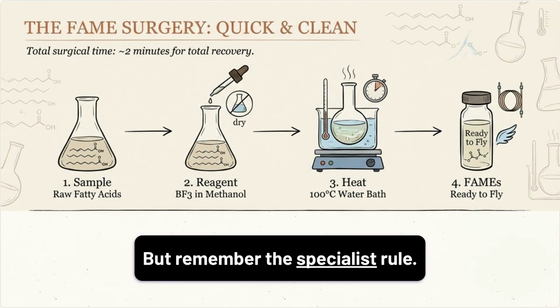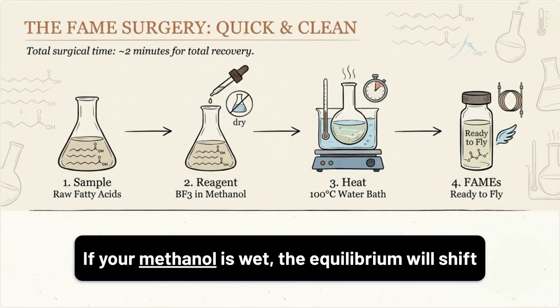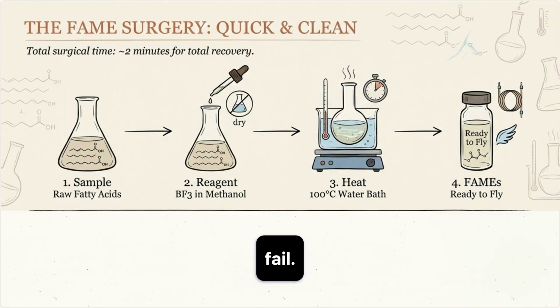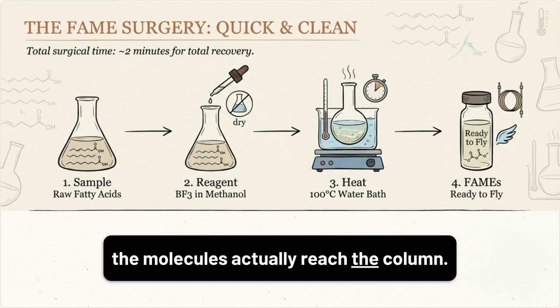But remember the specialist's rule. The efficiency of this reaction depends on the methanol purity. If your methanol is wet, the equilibrium will shift back toward the acid, and your makeover will fail. Speed is useful, but precision is what ensures the molecules actually reach the column.